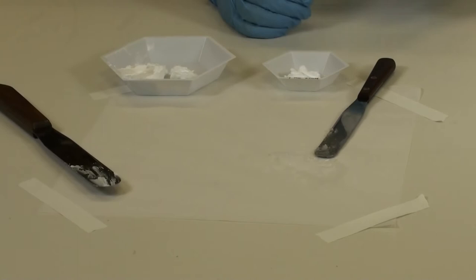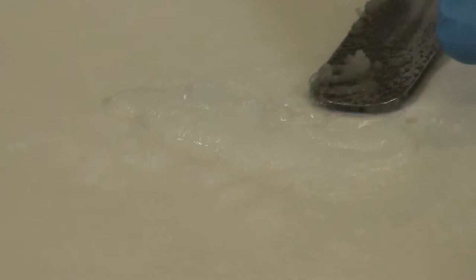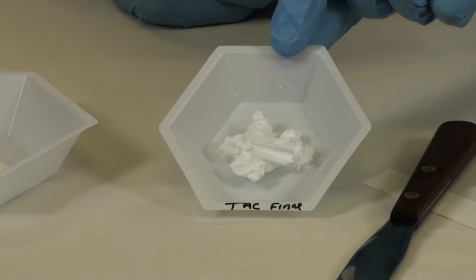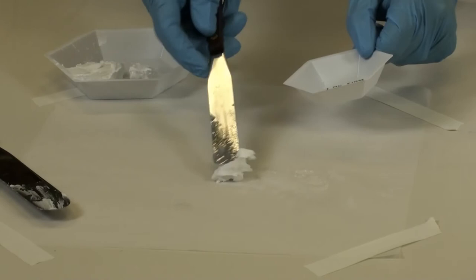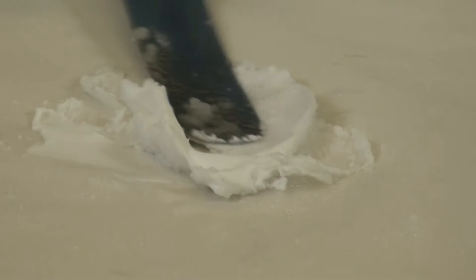All right, so as a reminder, on our ointment paper, we have the levigated urea paste that we levigated with the glycerin. Here is my triamcinolone cream that we weighed earlier, as well as my aquaphilic that we just weighed. The first step will be to go ahead and place our triamcinolone next to the urea and incorporate these together using spatulation until they're uniform.